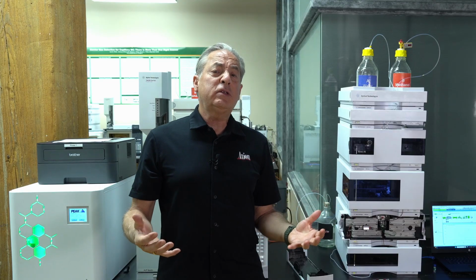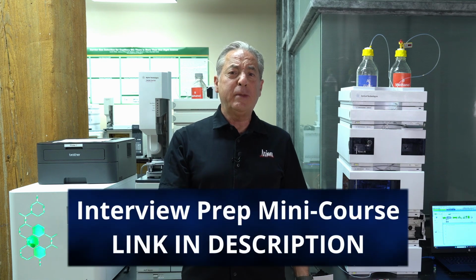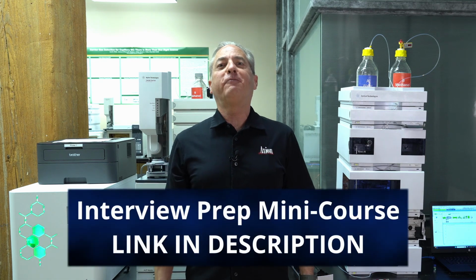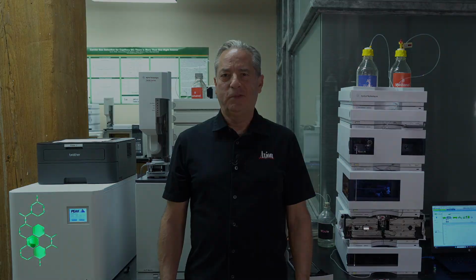So those are the components of both the GC and the LC. You can see the similarities. Of course, if you want the deeper dive, check out the deep version of this on Axion Lite, and I'll give you the real details.